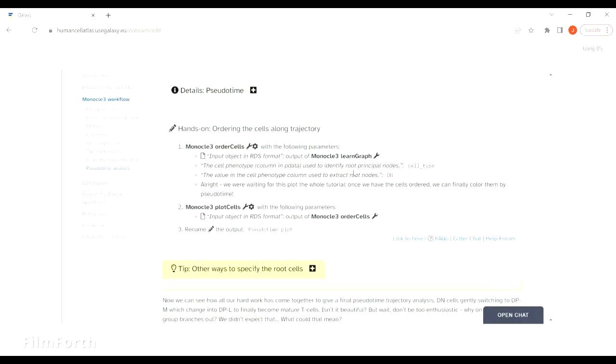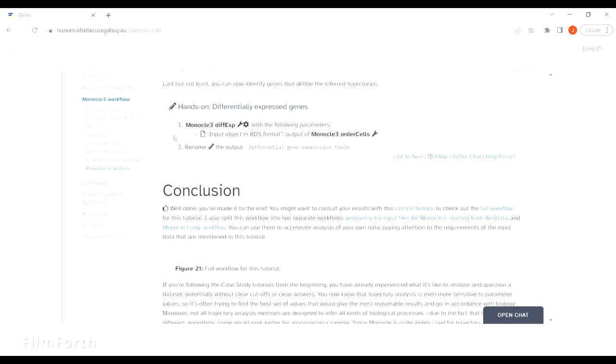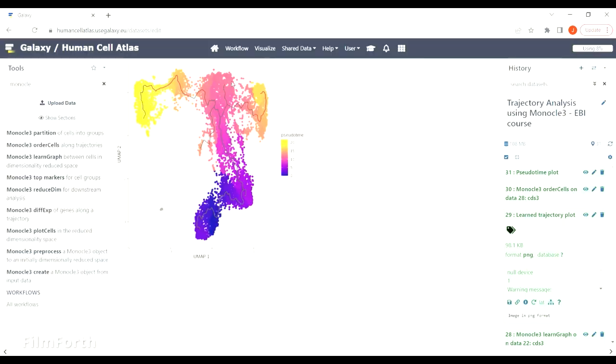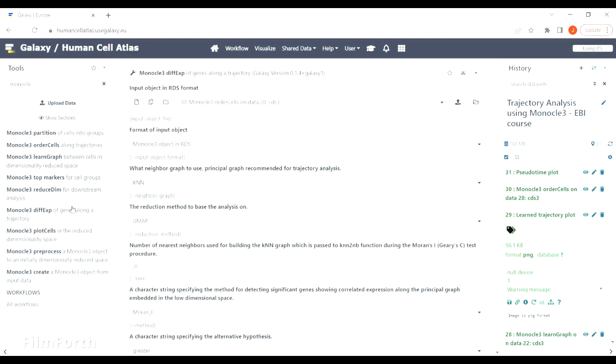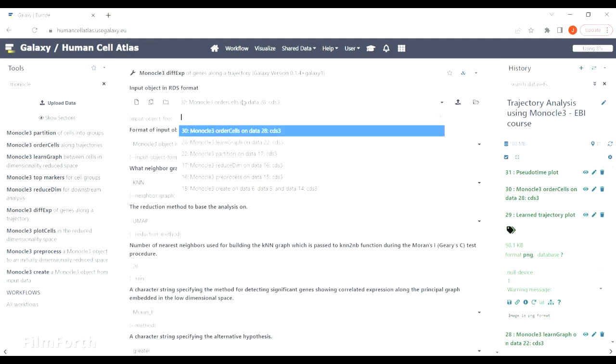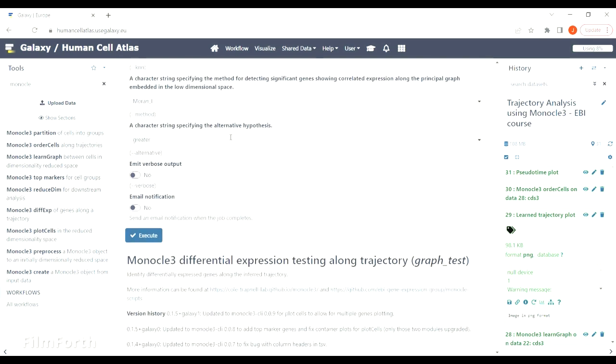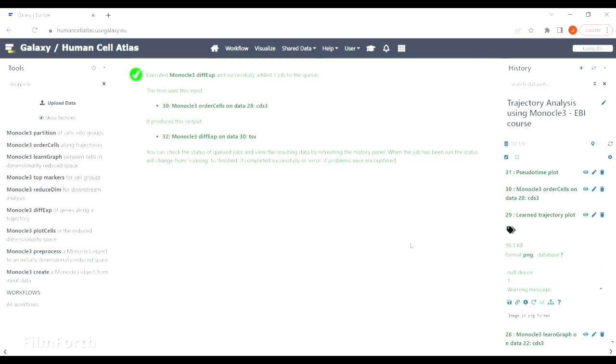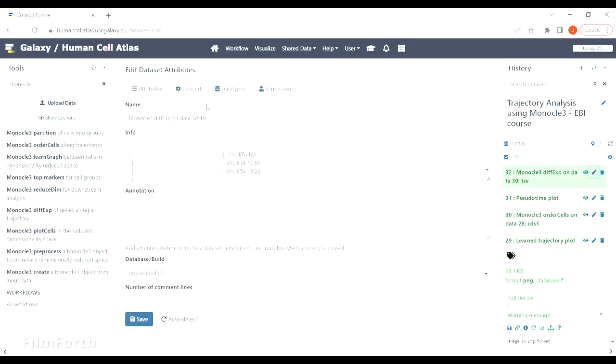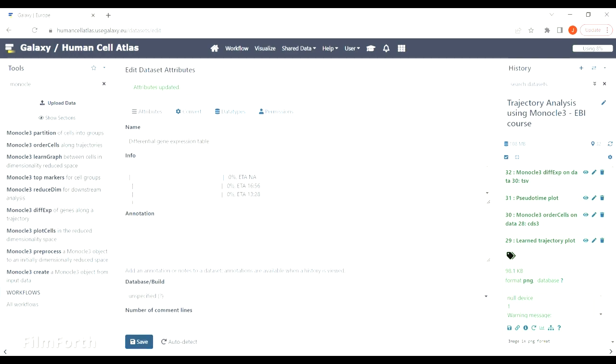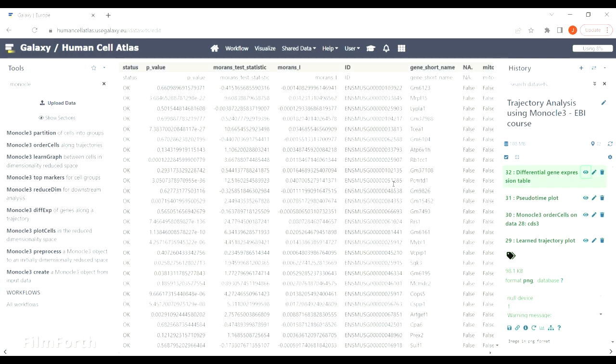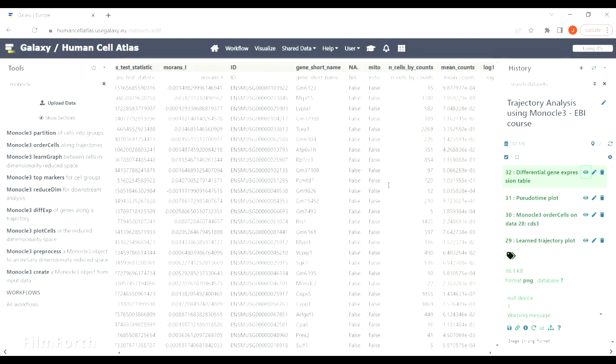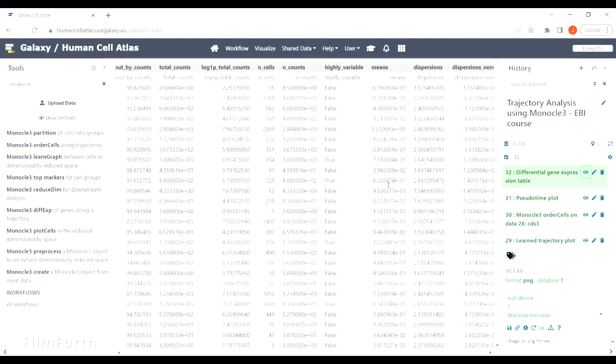Now there is actually a lot of other things you can do to analyze this data more in depth, but in Galaxy we will only use the tool for differential gene expression. There is a bunch of information that you can use for downstream analysis, but the aim of this tutorial was to show you the tools available in Galaxy to perform trajectory analysis using Monocle 3.